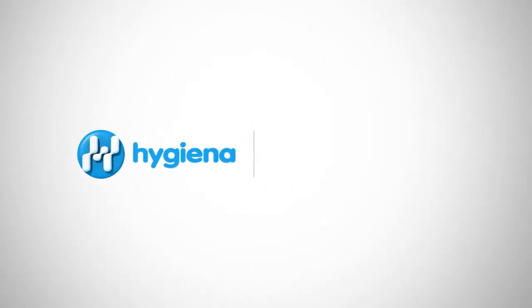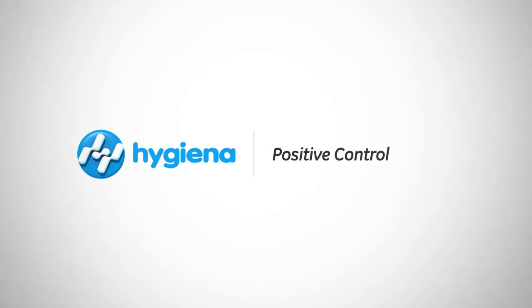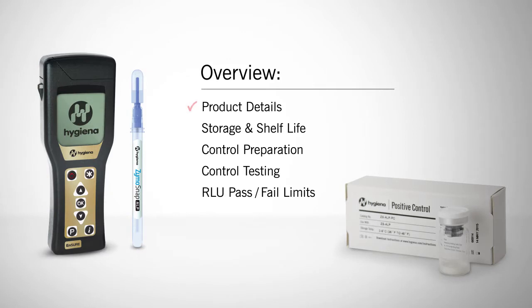Welcome to Hygiena's instructional video on how to properly use the Zymosnap ALP Positive Control Kit. In this video we will cover product details, storage and shelf life, control preparation, control testing, and how to establish RLU pass-fail limits.